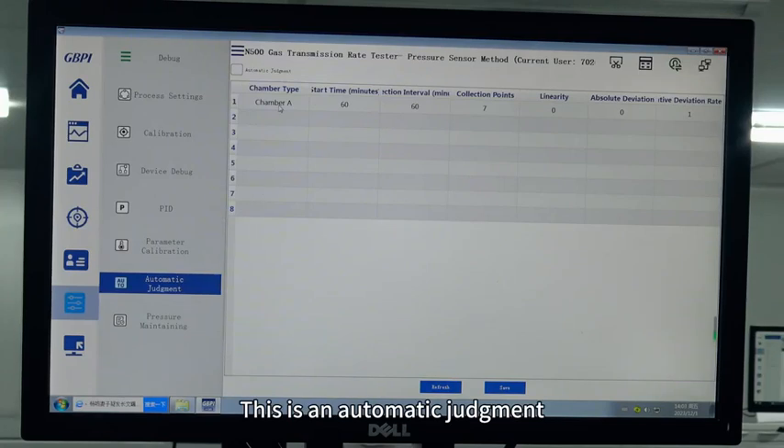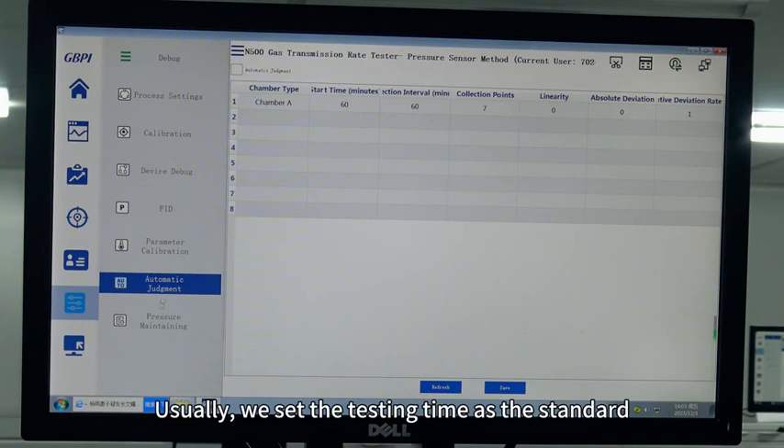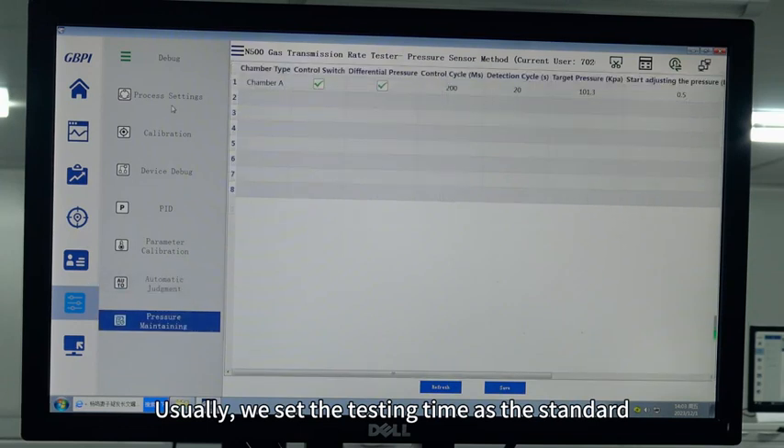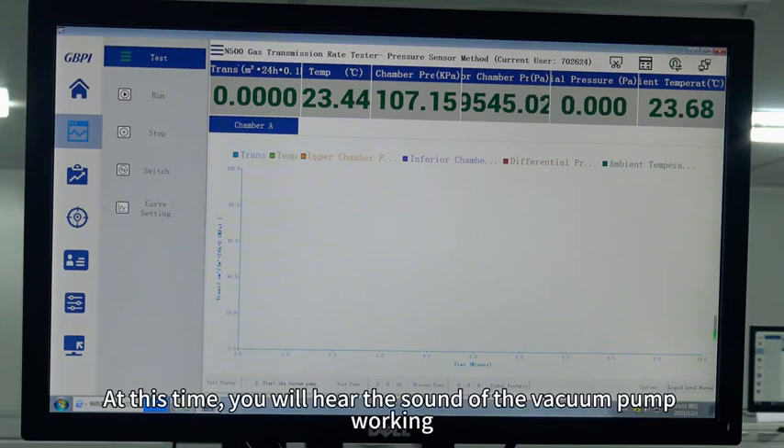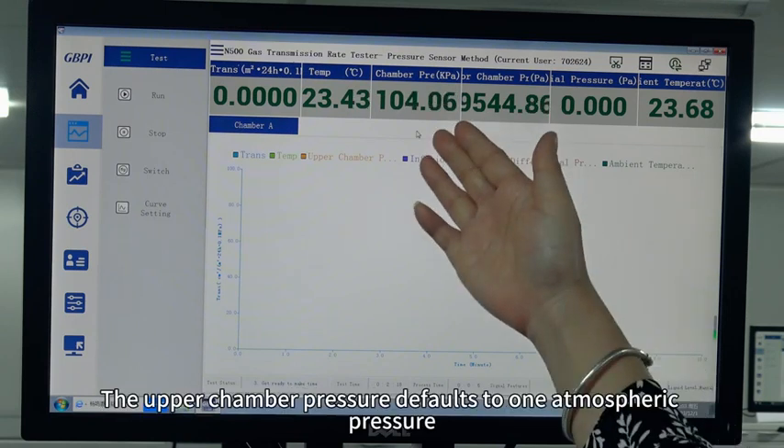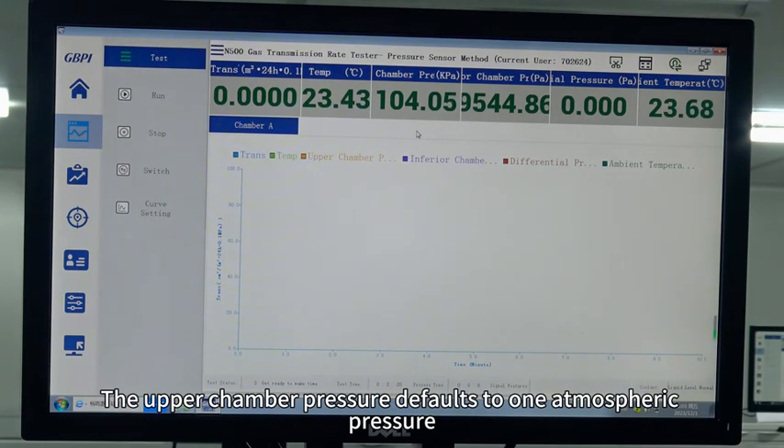This is the automatic judgment setting — we usually set the testing time as the standard. We are already starting to vacuum pump. At this time you will hear the sound of the vacuum pump working. The upper chamber pressure defaults to one atmospheric pressure.